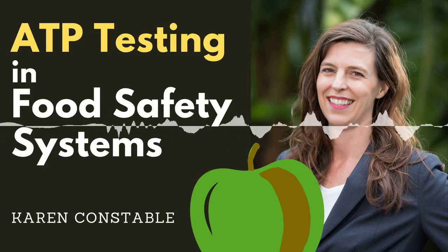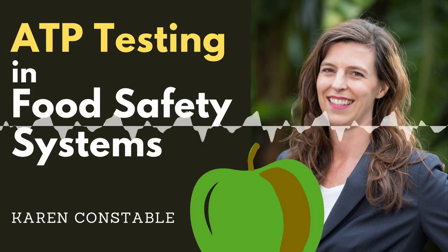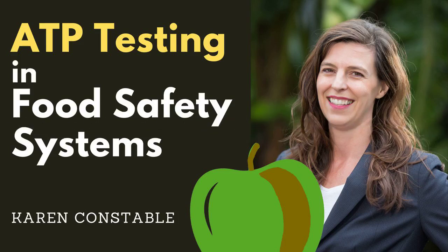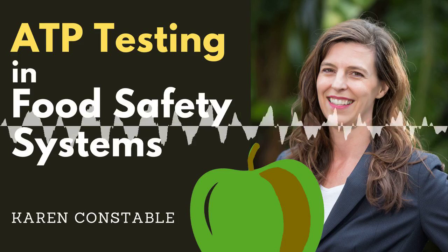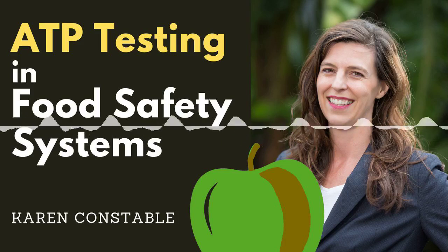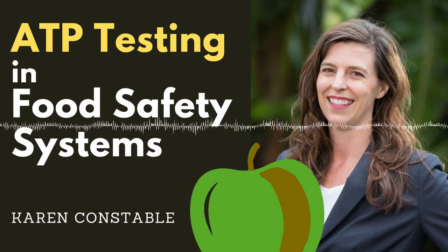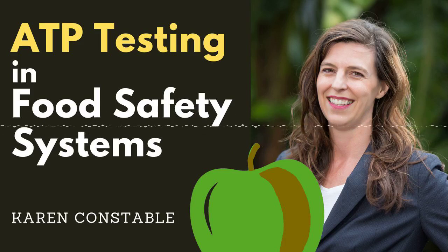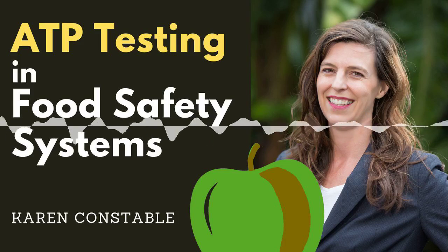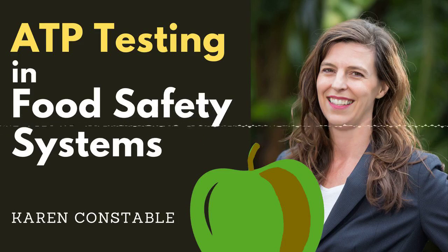So ATP testing can be used to detect the presence of organic material, such as food debris or microbial biofilm on a surface. Microbial techniques provide different information to ATP tests. They can differentiate between viable and non-viable microorganisms and food residues. They can also provide more quantitative information and be used to identify the presence of specific pathogens or indicator organisms on a surface. However, they take a lot of time to yield results compared to ATP testing.